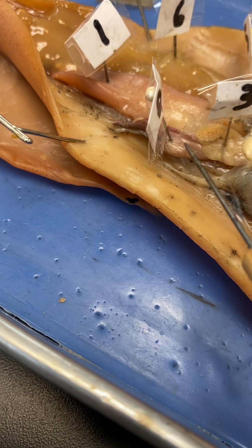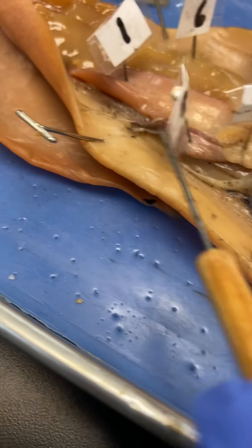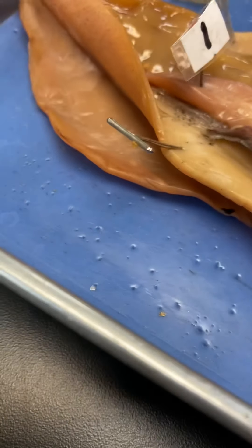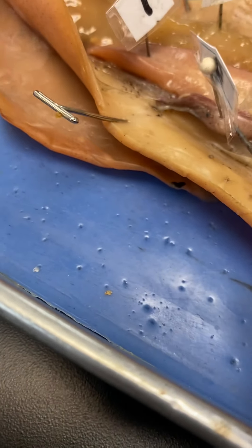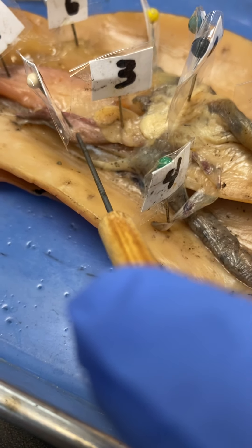Hey everyone, some review over the squid again. I actually got a little bit of a better specimen this time for the male, so if you want to pause it so you can see the structures, I do have a number I'll go over.